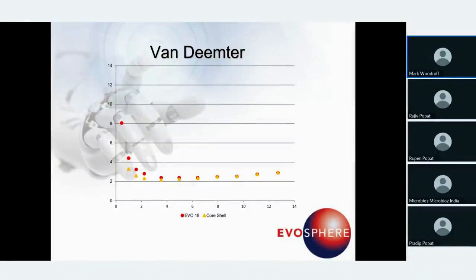If you try this on a 3 micron traditional particle, what happens is that you very quickly lose efficiency because you cannot use the higher flow rates and still retain the efficiency of the system. The traditional 3 micron fully porous particles will not allow you to use higher flow rates to gain speed. Your compromise will be losing efficiency very, very quickly. So we're in a position now with monodispersed particles where it's right at the forefront of particle technology.